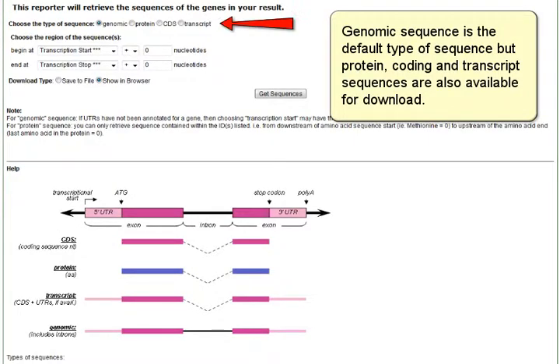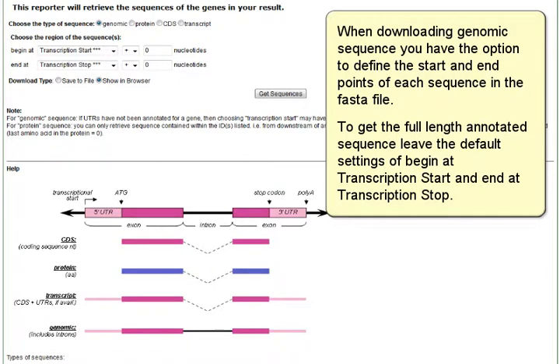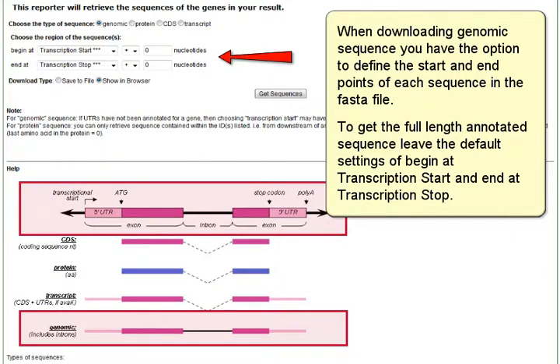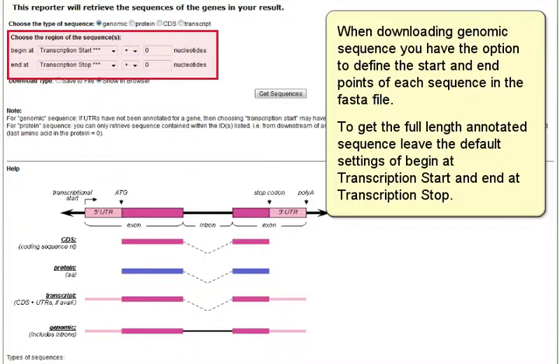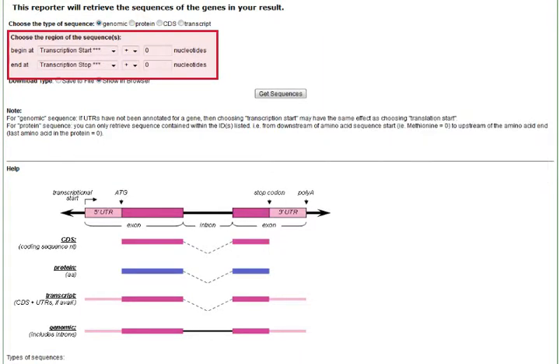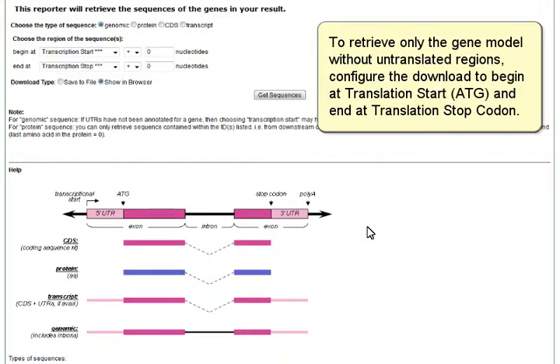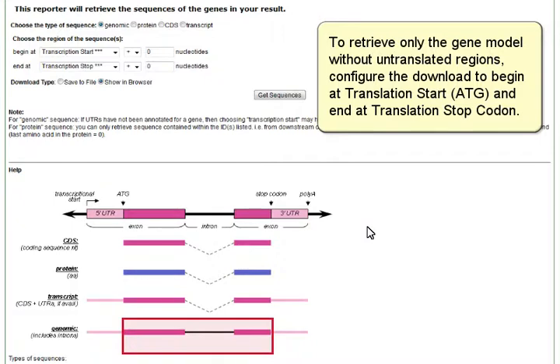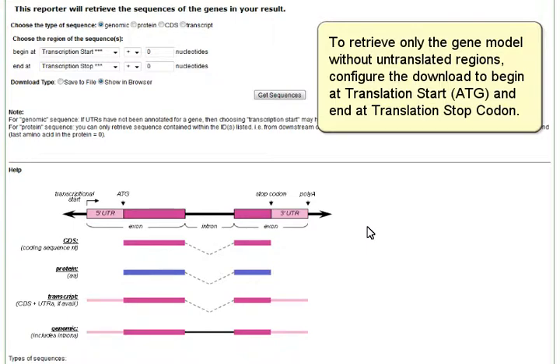Genomic sequence is a default type of sequence, but protein, coding, and transcript sequences are also available for download. When downloading genomic sequence, you have the option to define the start and end points of each sequence in the FASTA file. To get the full-length annotated sequence, leave the default settings of Begin at Transcription Start and End at Transcription Stop. To retrieve only the gene model without untranslated regions, configure the download to Begin at Translation Start and End at Translation Stop codon.